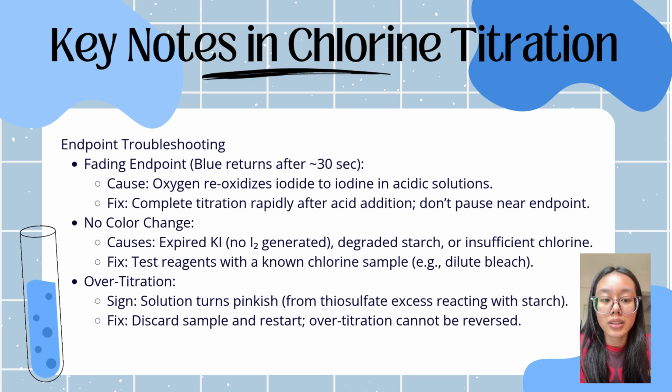Second, no color change. Causes: expired KI, degraded starch, or insufficient chlorine. Fix: test reagents with a known chlorine source, for example, dilute bleach.